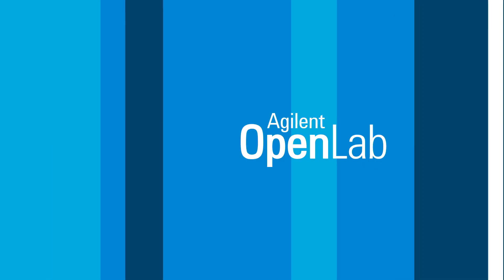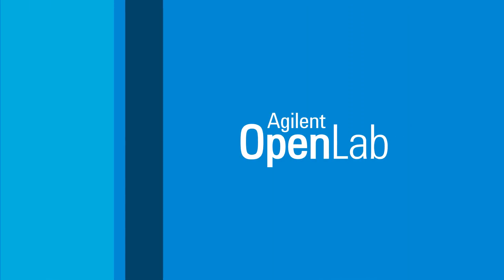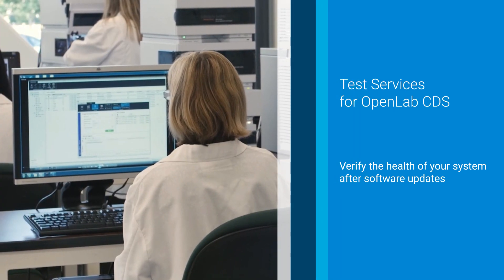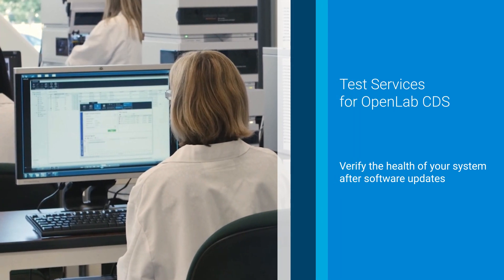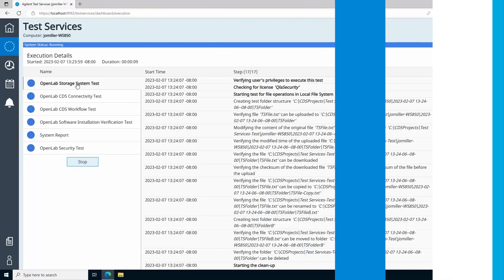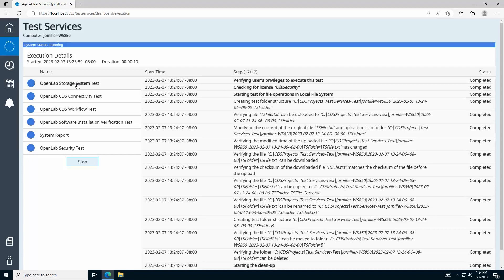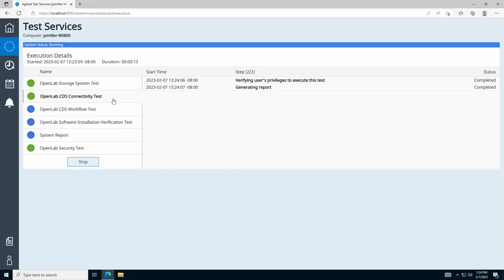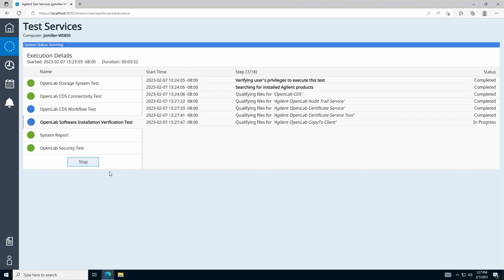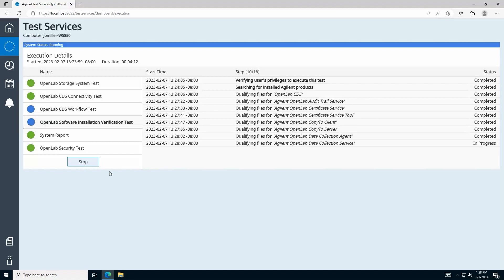Now there's an easier way to verify the health of your OpenLab system after software updates. In this video, I'll show you how to use Test Services for OpenLab CDS. Test Services is an automated qualification tool that confirms your software is operating as intended by running a series of software qualification and verification tasks.